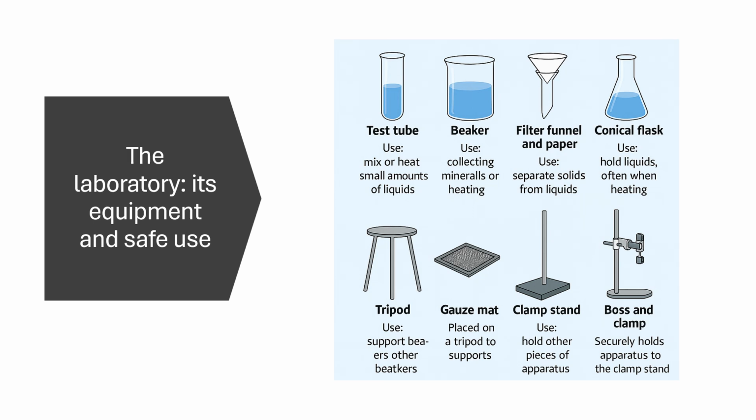And then the beaker. Why do we use a beaker? You can collect, mix and heat chemicals in the beaker. In the beaker you can normally see calibrations, so you can find 50 milliliter beakers, 100, 250, 500, 1 liter or more.